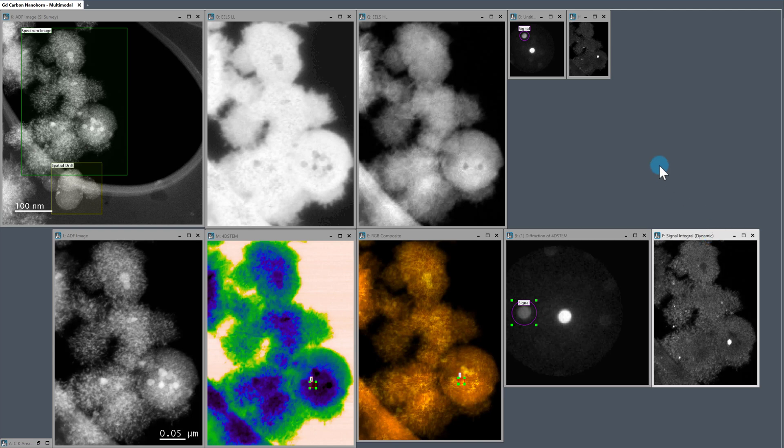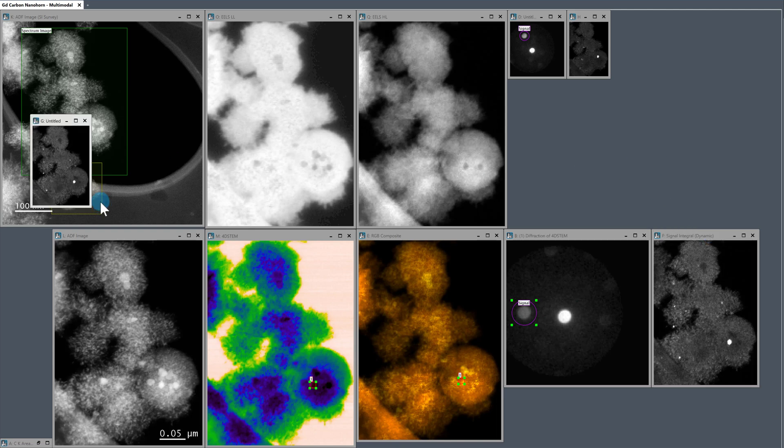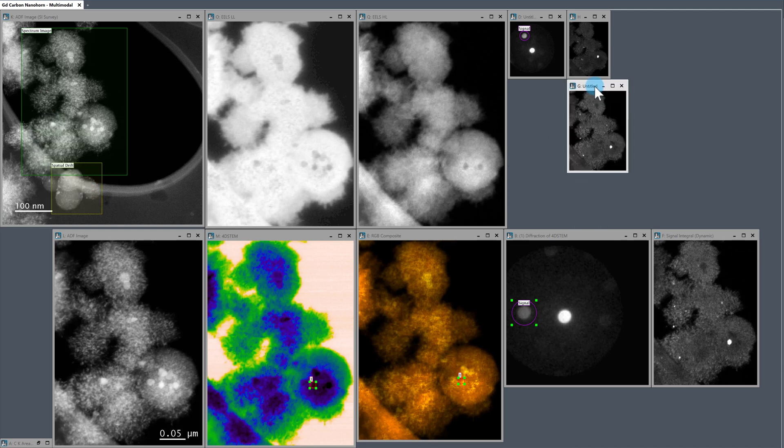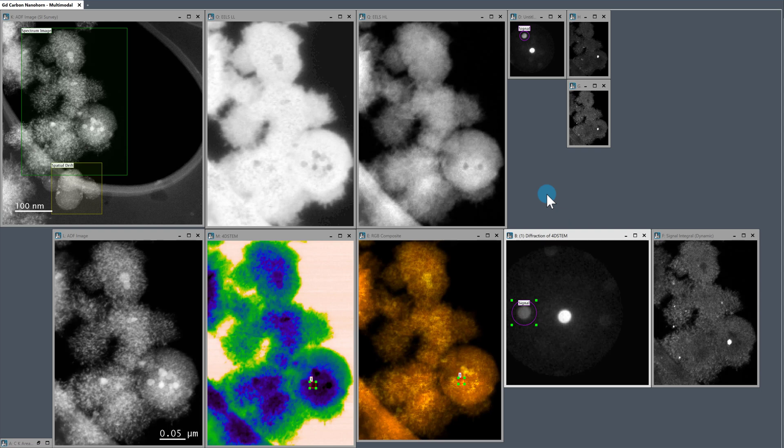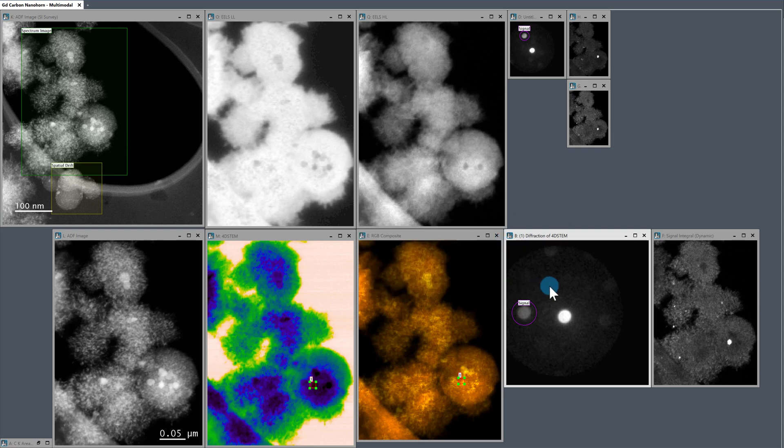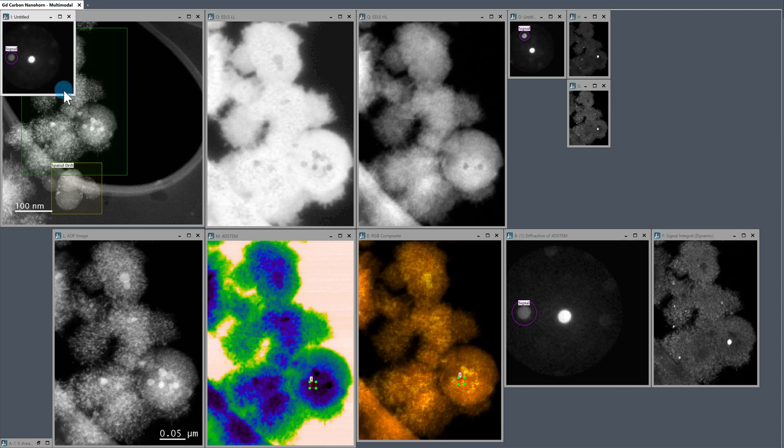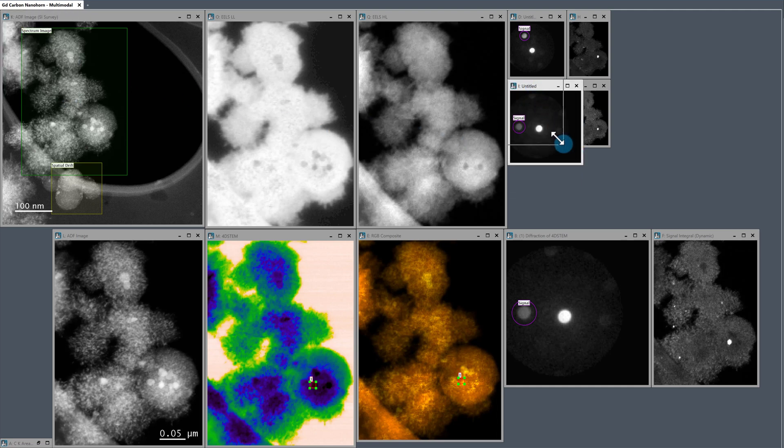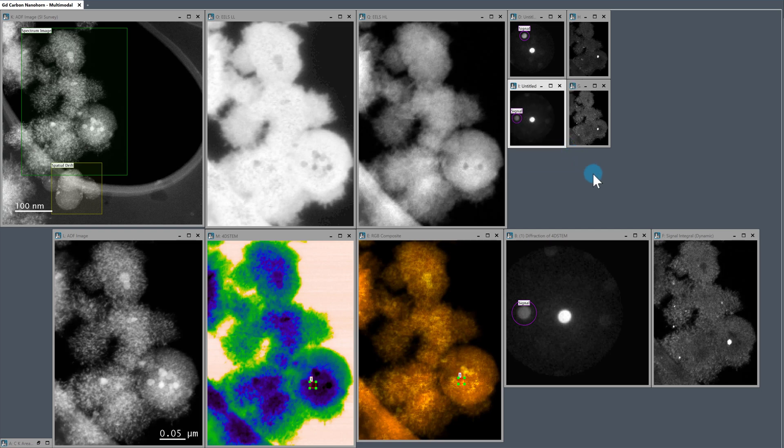So I'll place that guy there. Do the same thing with the diffraction pattern, which it corresponds to. So copy, paste. So you can kind of get an idea of what I'm doing here. So we have the second.